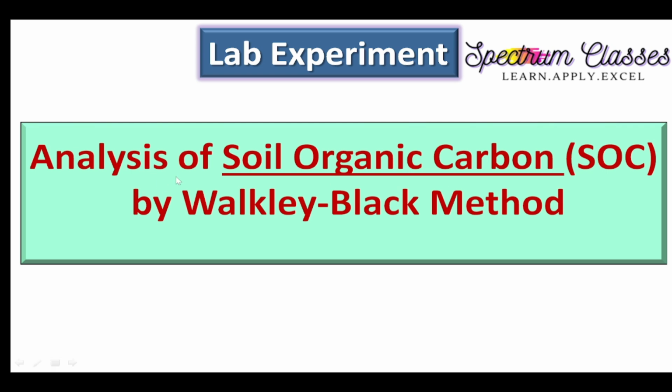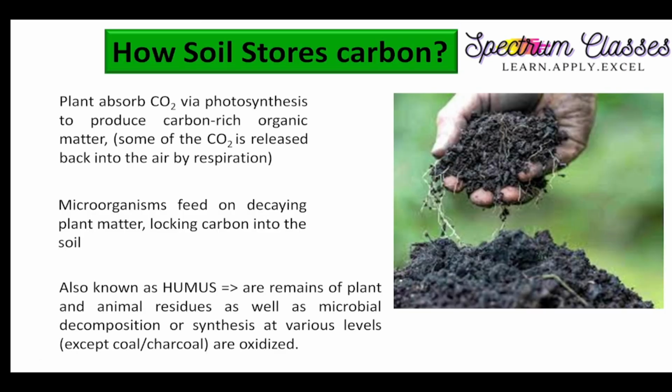In this video, I am going to perform a lab activity related to the analysis of soil organic carbon by the Walkley-Black method. Before performing the lab activity, I am just going to explain what soil organic carbon is. There are several factors which are responsible for soil organic carbon.